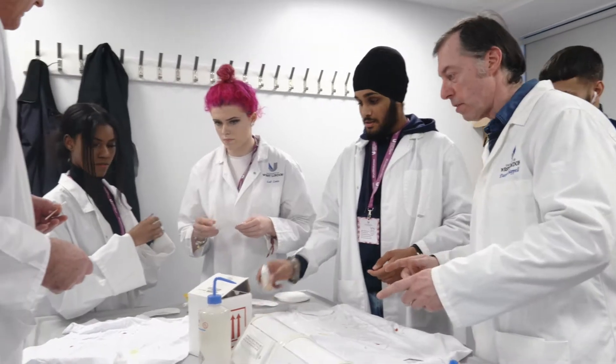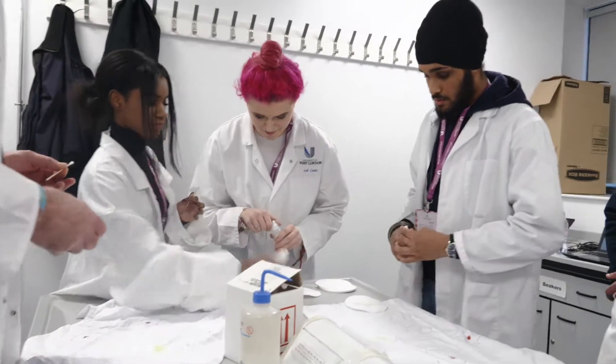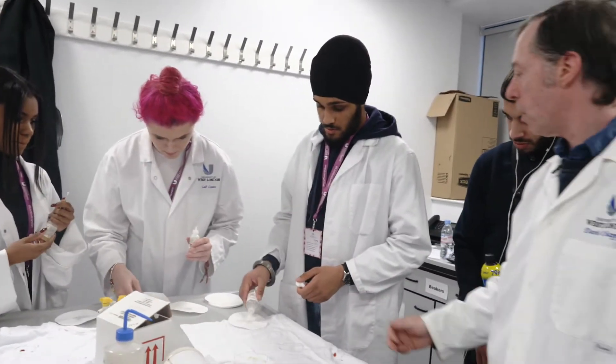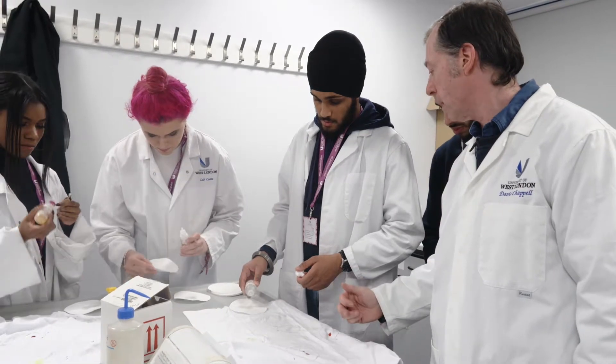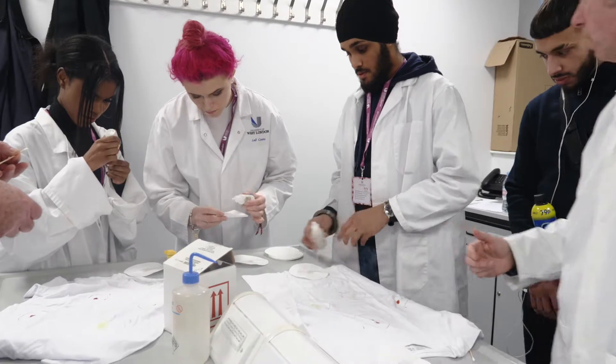There are three solutions — this is the second one, and there's the third one. The third one is the oxidiser. So it's already gone after the second, so that's a false positive. It should only go after the third one. So that's not blood, because it went after the second one.